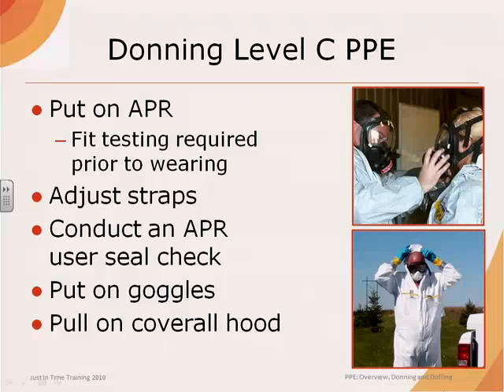Next, put on the assigned air purifying respirator for which you have been medically cleared and fit tested for. Using the buddy system, conduct a check to ensure that your APR seals properly. If the proper fit cannot be achieved, do not enter the area where protection is required. Next, put on goggles if eye protection is not provided by your air purifying respirator. Take care not to disrupt the respirator seal.